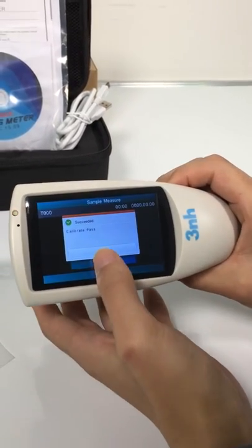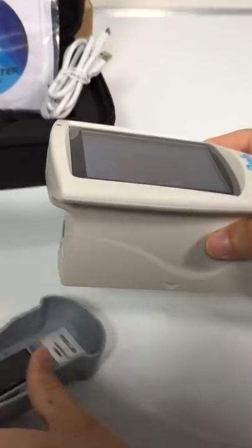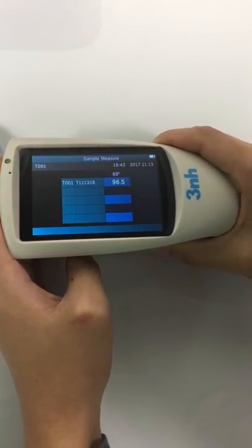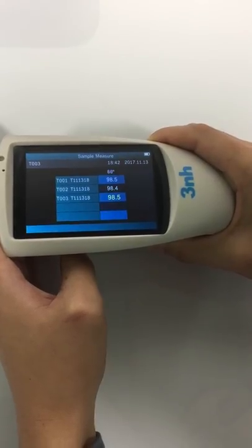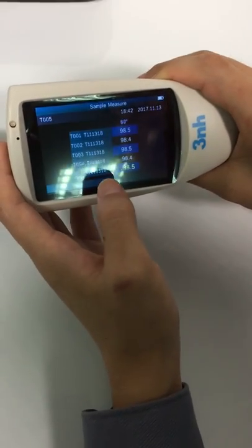The calibration has finished. It's ready for mirroring. These are the test results.